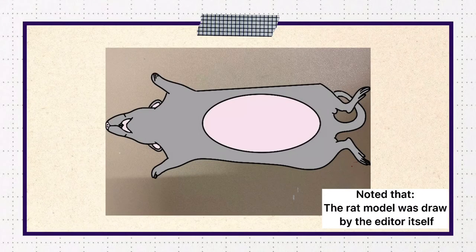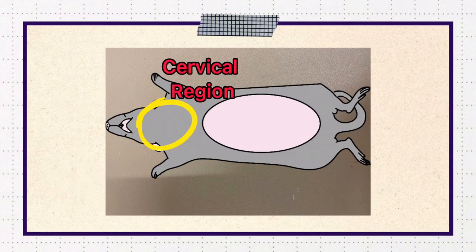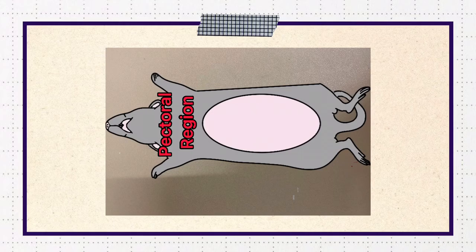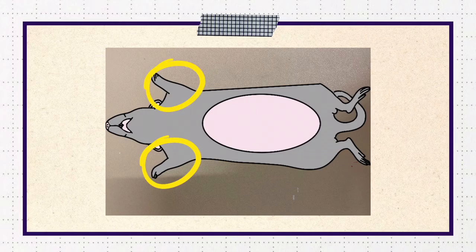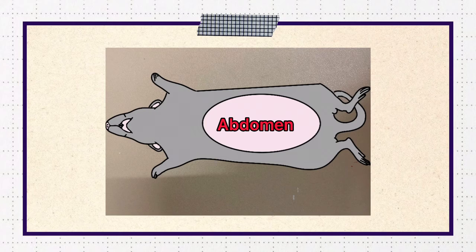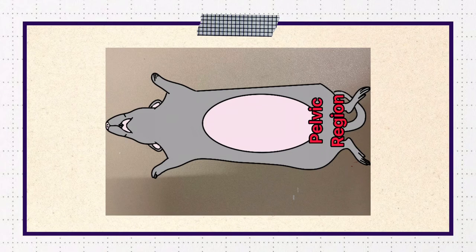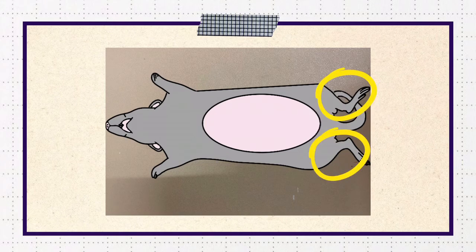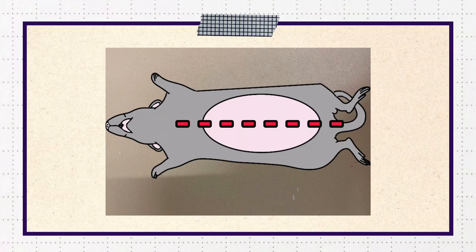First, the rat was placed on the dissecting tray. We can see there is the cranial region or head, cervical region or neck, pectoral region which is the area where the front legs attach, thoracic region which is the chest area, abdomen or belly, and pelvic region which is the area where the back legs attach.